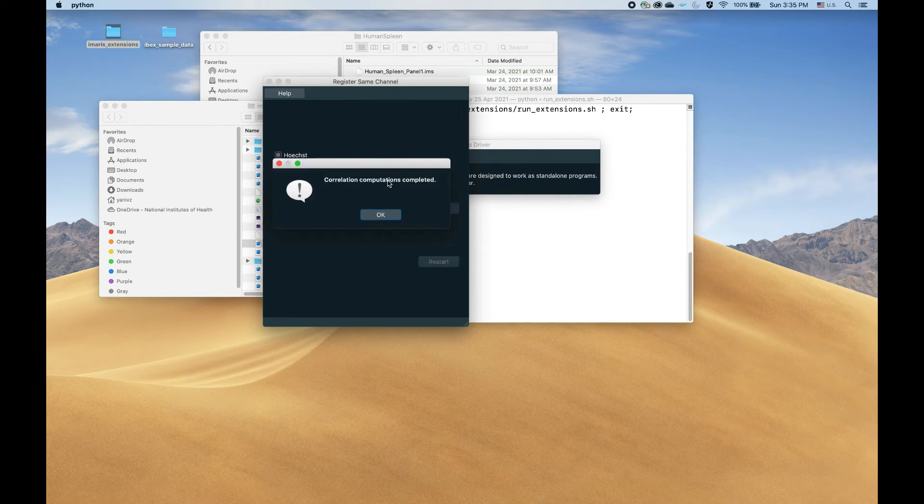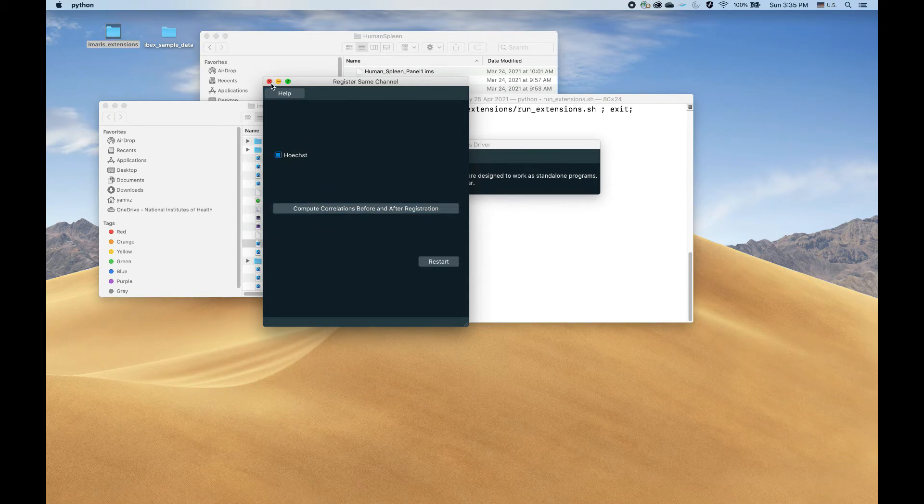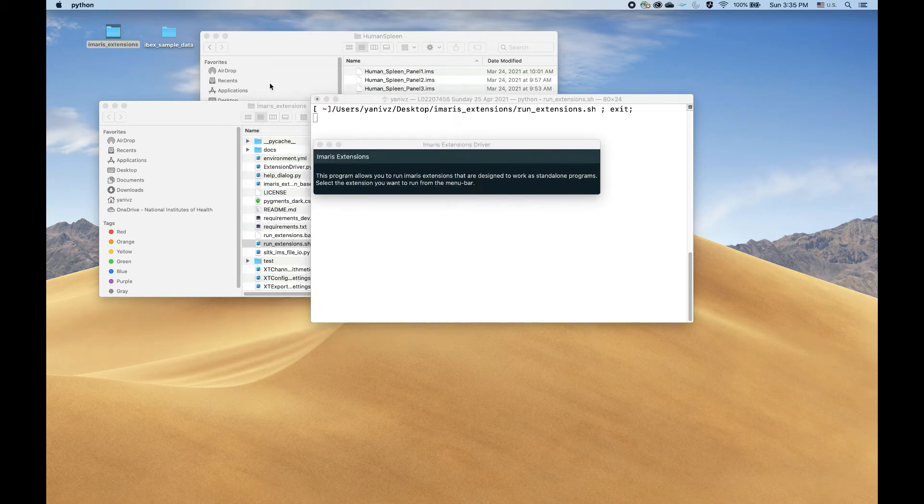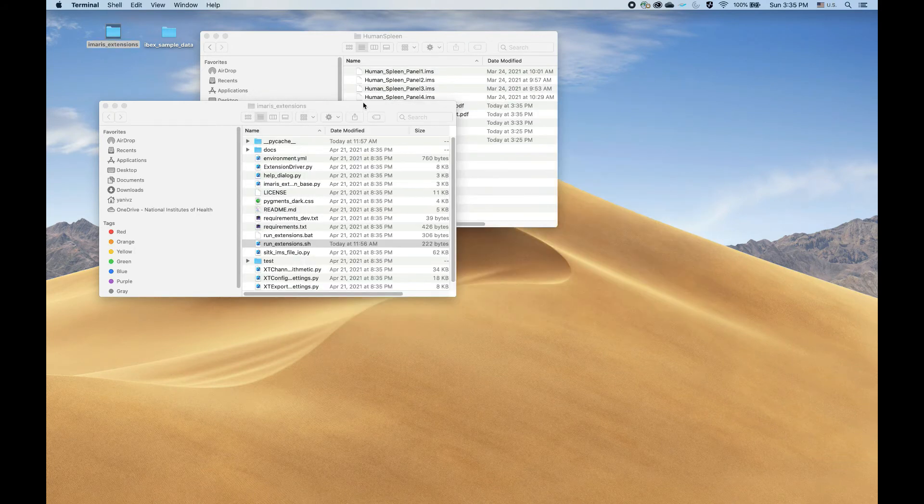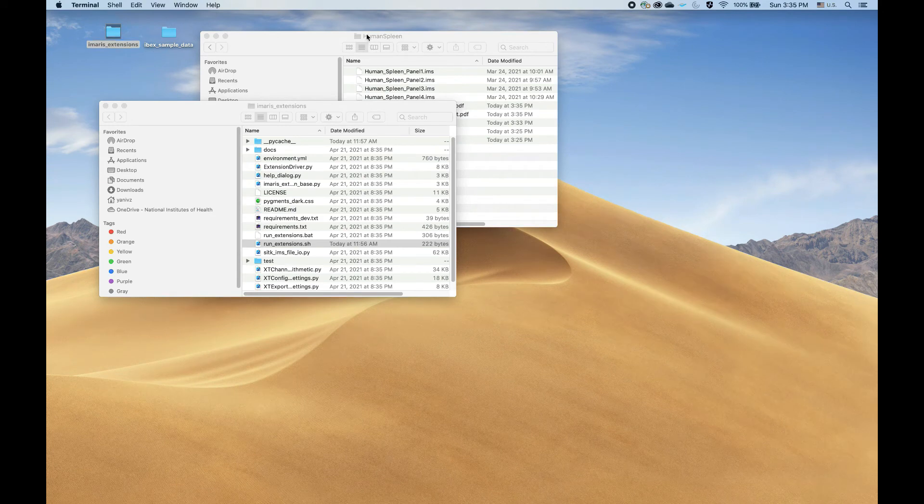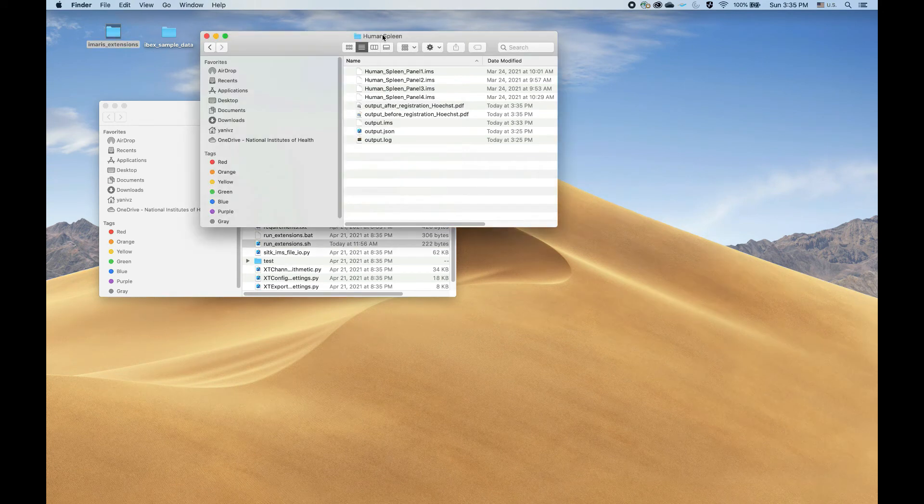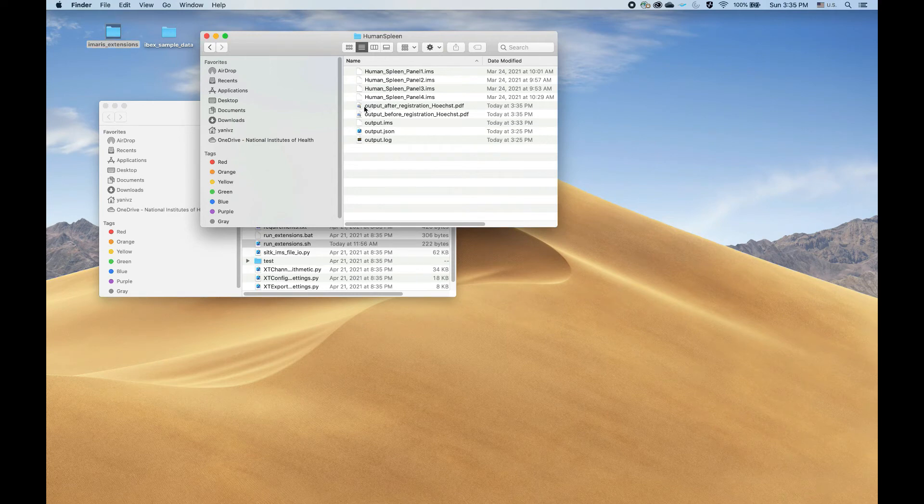Okay, so we've completed the computations, and now we can take a look at what came out of all this registration. Let's close all the extension information there, and the output from the extension if you enable all outputs are five files.